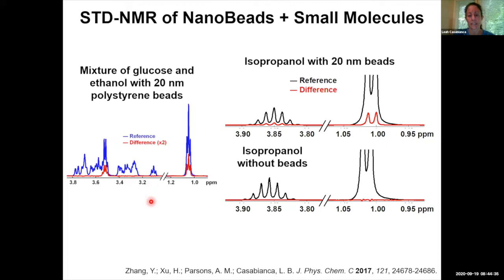One of the problems with the STD-NMR technique is that it is prone to false positives. If your small molecule aggregates, or if you're accidentally perturbing the ligand resonances with your off-resonance saturation, you may see an STD effect where you don't actually have binding.